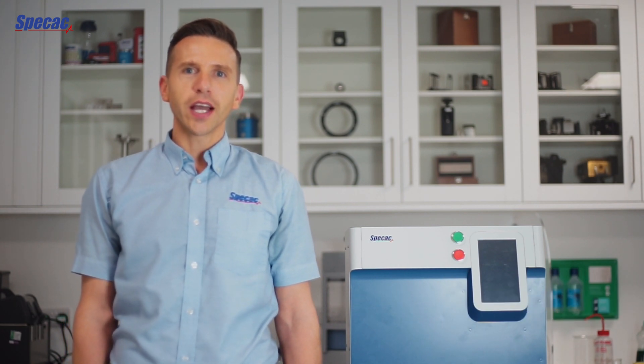Hello, I'm Jim Williams, International Sales Team Leader here at Specac Ltd, and today I'm here to introduce our brand new hydraulic press product, the APEX 400.